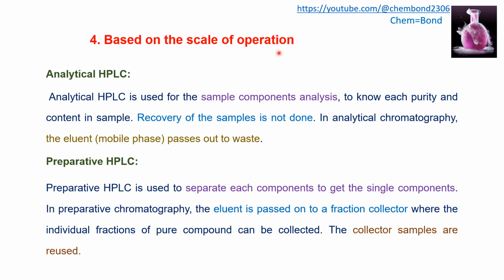Based on scale of operation, there are analytical HPLC and preparative HPLC. Analytical HPLC, as the name indicates, is used for component analysis, and the sample is not recovered in this process. In this process, the eluent or mobile phase passes towards the waste.